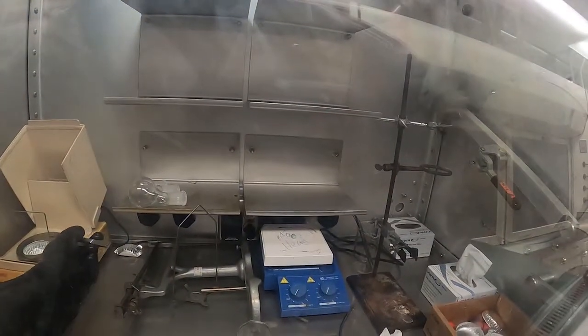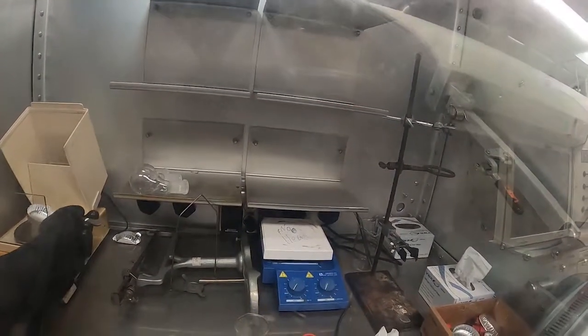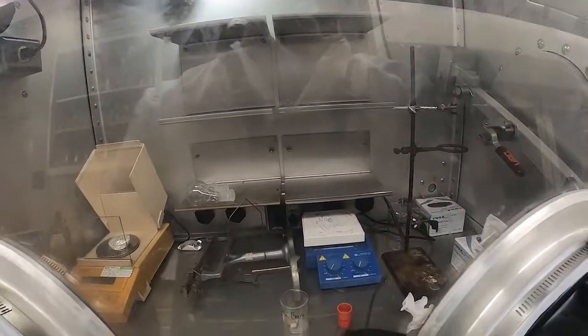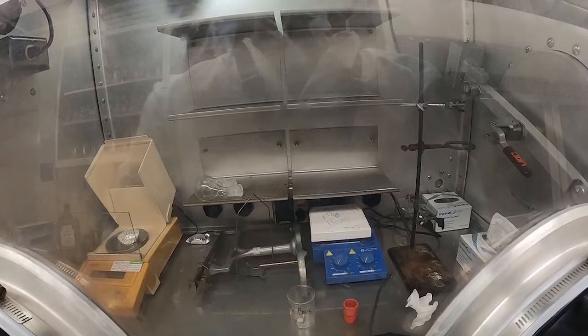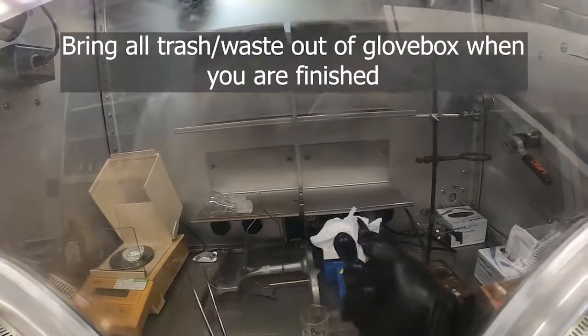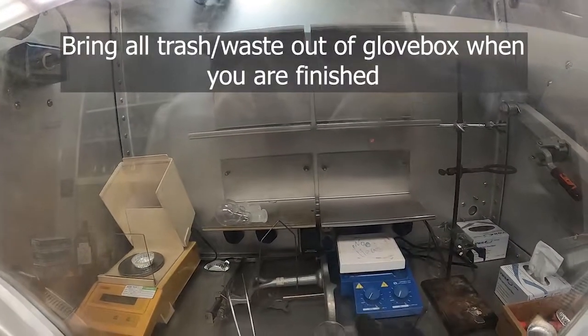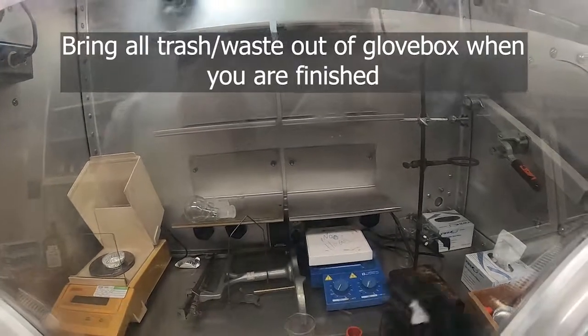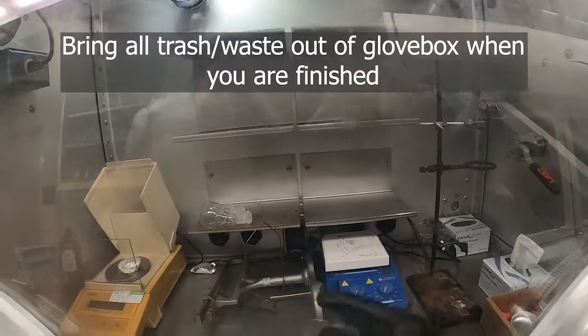Moving slowly is always the best approach. You might also have to learn how to do things with your non-dominant hand, depending on where things are situated in the glovebox. If you make a mess in the glovebox, use kimwipes, and if you have dirty stir bars from whatever you might be doing, bring them out of the glovebox with you.